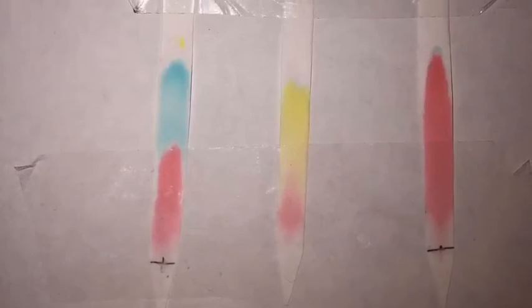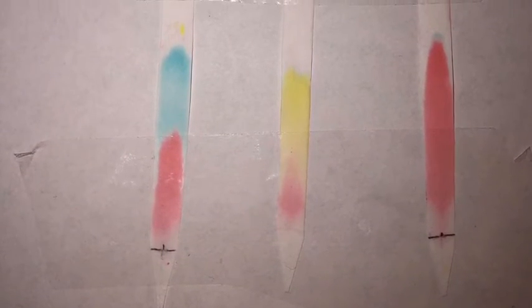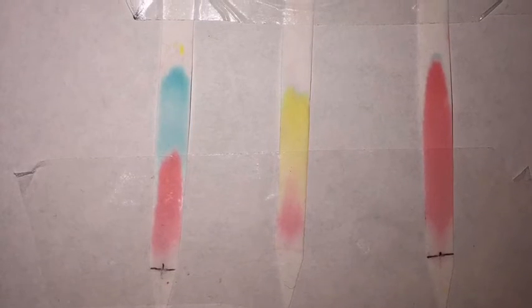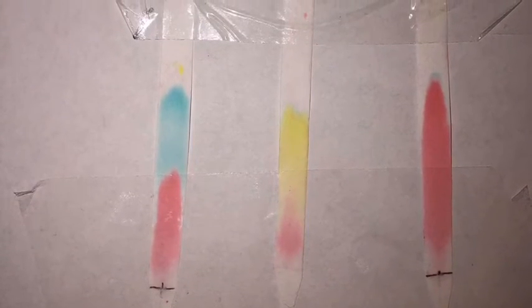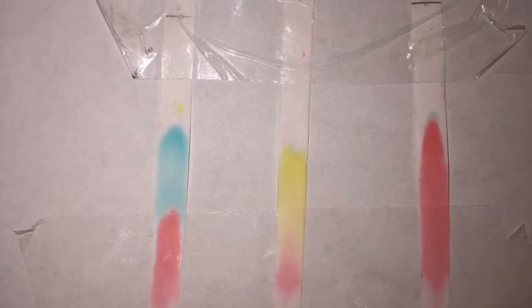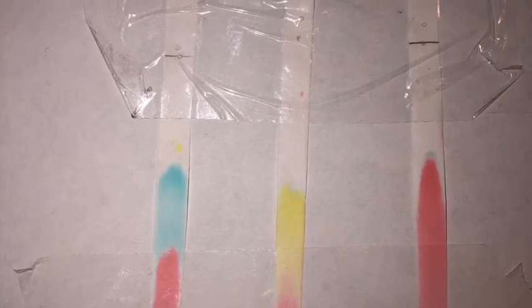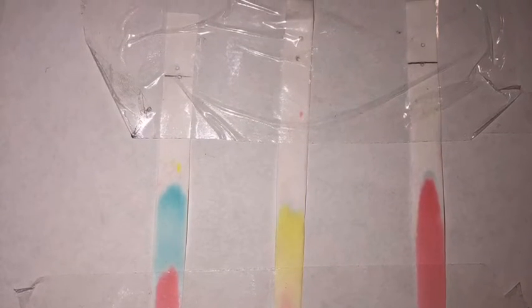These results of the grape, orange, and strawberry flavor revealed that grape and orange separated into 2 different colored components, where strawberry Kool-Aid did not separate. This means that strawberry was the only pure compound which consisted of only red number 40 dye, whereas orange and grape consisted of 2 colored dyes, blue number 1 and red number 40 for grape, yellow number 5 and red number 40 for orange.